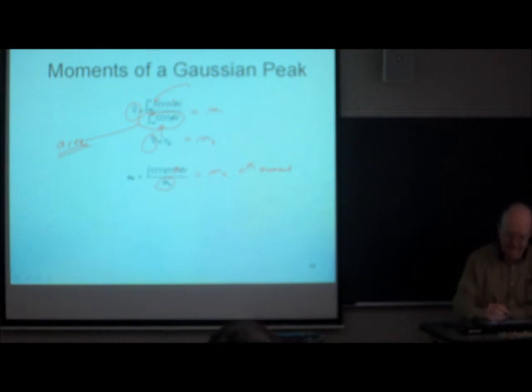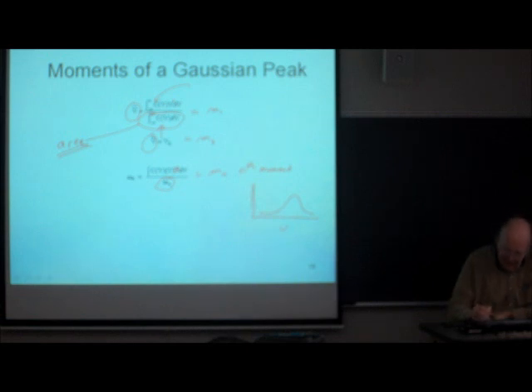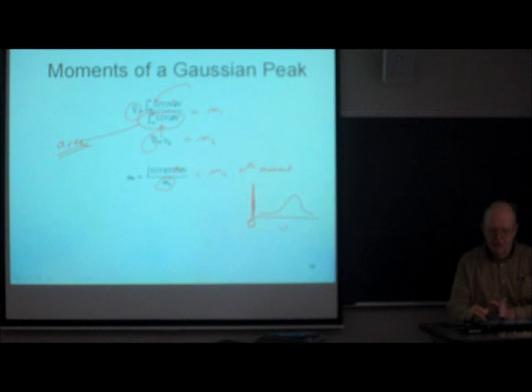Now, by the way, let me do a little sketch here. So here's volume, and there's my peak. When I compute a moment this way, multiplying by V to the n, I'm really computing the moments of the peak about the 0 point of the horizontal axis, whether it's volume or time, doesn't matter. I'm computing the moment of this about that.